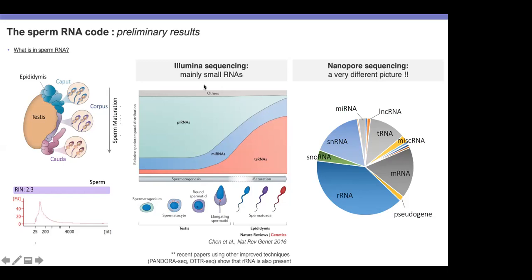If the mapping were better, I would say yes, it's going to be better. But maybe you have to choose to map the transcriptome in your case, if that's what you really care about. If you're interested in some genes that have a lot of pseudogenes, maybe you should not map the genome for those. Maybe you should map a transcriptome, but then you will miss other things if you already assume that that's your transcriptome.